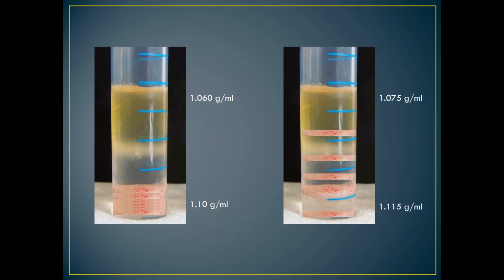So in order to avoid this, we use a high density purification process in which we use a high density for the bottom. With this procedure, it pushes the exocrine cells to the top layers. So we collect 1 to 12 layers in order to collect the islet cells. In this procedure, the islet purity is not really great, but at the same time, we could eliminate a lot of exocrine cells which are sedimenting in the bottom.